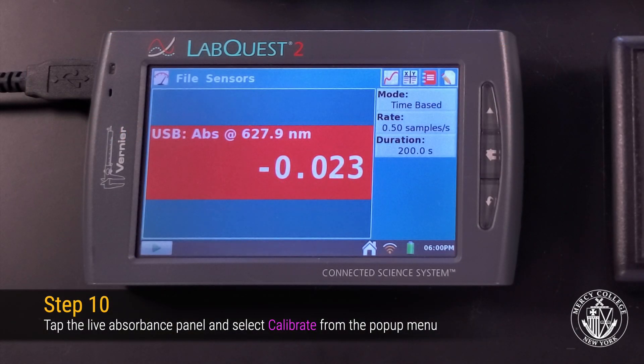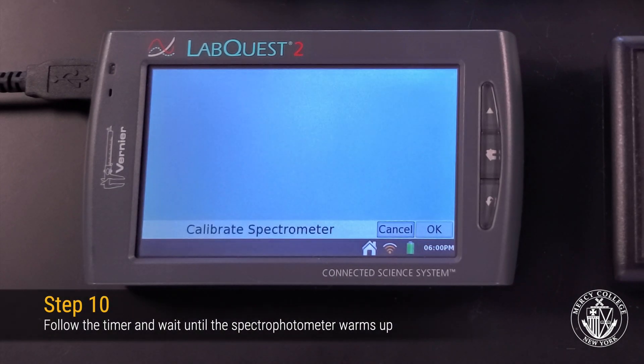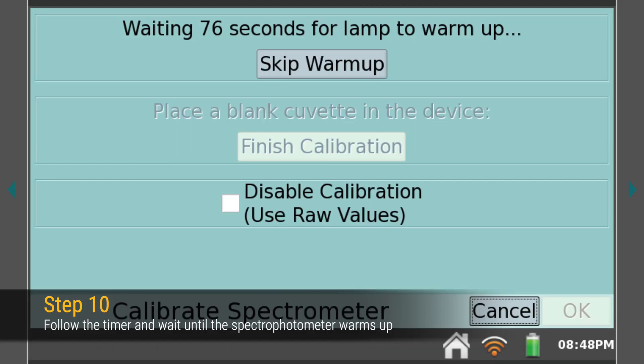Now tap on the absorbance panel and select Calibrate to calibrate your spectrophotometer. Again, wait for the lamp to warm up before you insert your blank.